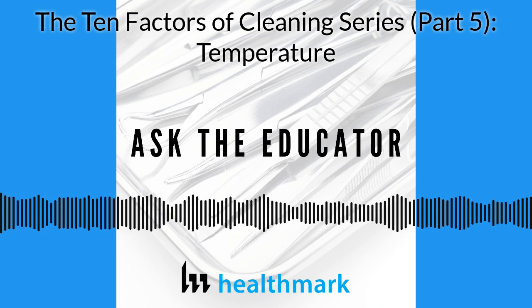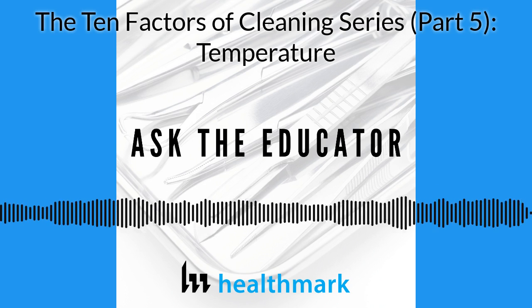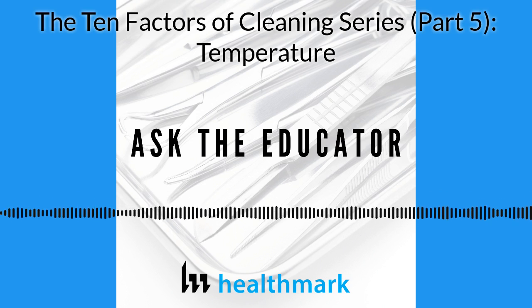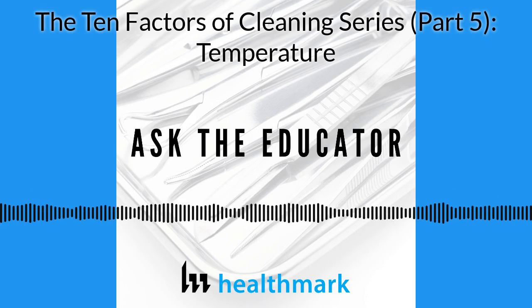Yeah, I want to get to that in a minute, but you've really stressed something, and this is what people, I think, tend to forget. No two cleaning chemistries are the same. You buy an automated washer and they set different parameters. Those washers were tested with usually that company's cleaning solution. So if you change something else, each cleaning chemistry has an optimal temperature.